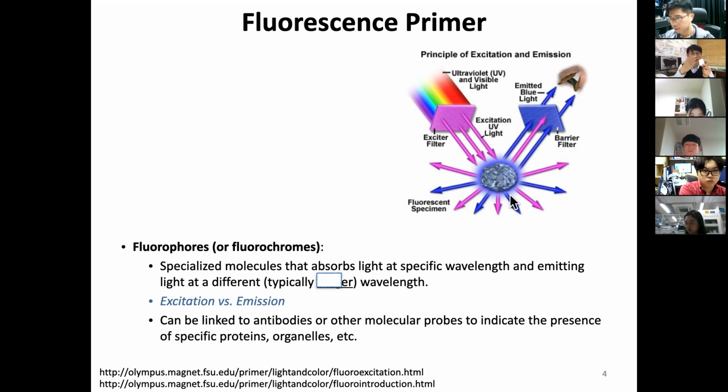Of course, if you shine some light, it will directly scatter and reflect, so you see the same color. However, people realized there are some other colors coming together. To find it out, you put another cellophane tape, which blocks the original UV. It looks like purple, blocked, and then you still see some light coming through.